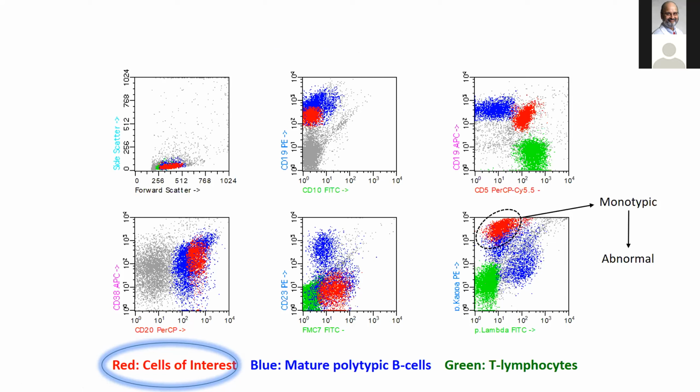It just tells me that I've got a monotypic population. So monotypic most likely means monoclonal. Okay, so most of the time when you have a monotypic B cell population, it's going to be arising from a single cell, and it's monoclonal. That doesn't hold up 100% of the time, though. Monoclonal populations are most likely going to be neoplastic and most likely going to be a malignant neoplasm. Okay, but that doesn't hold up 100% of the time either. But that's what is most characteristic.